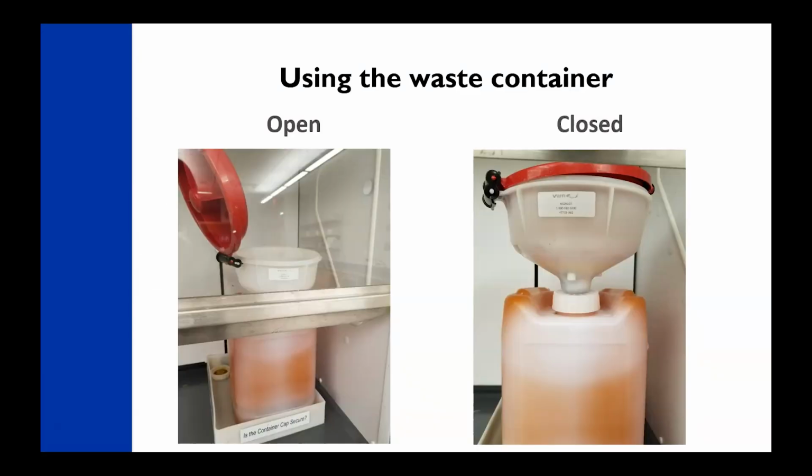When pouring waste in the waste containers in the hood, please double check before you pour your waste in the waste container that the funnel is open or in the up position as shown on the left and not closed as shown on the right. When multiple students pour waste into the closed lid of the funnel, it becomes not only a safety hazard for others in the lab, but also a serious safety hazard that results in injury to our personnel preparing your labs.